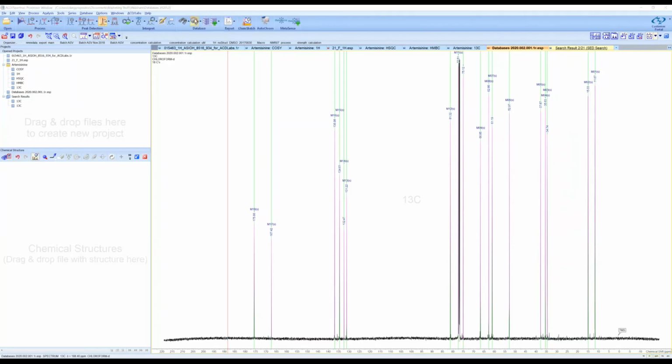If you select this and click the search again, you are presented with a window to type manually the peak frequencies that you want the system to search for in the database. So this is used for searching things that are known, but it could have another possible use, and that would be to search for things that are not generally known, but they may be known to you.